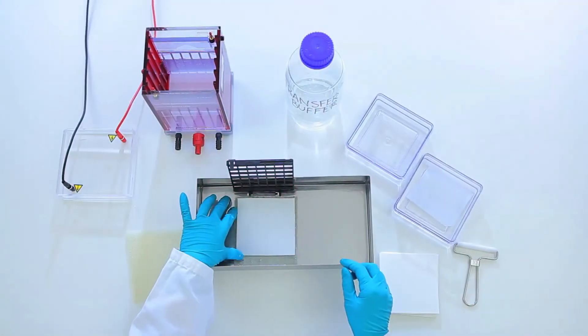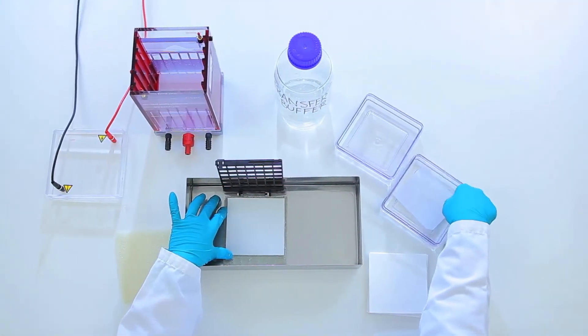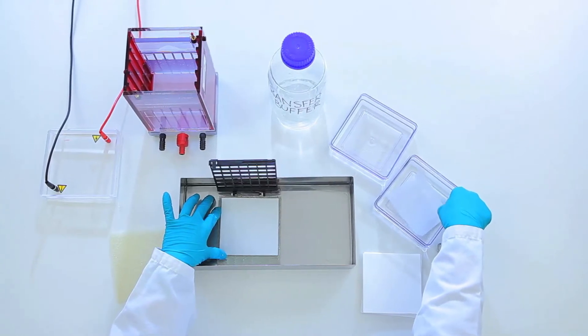This step-by-step, hands-on demonstration of Western blotting is designed for those of you new to the technique, making it easy for you to get started.